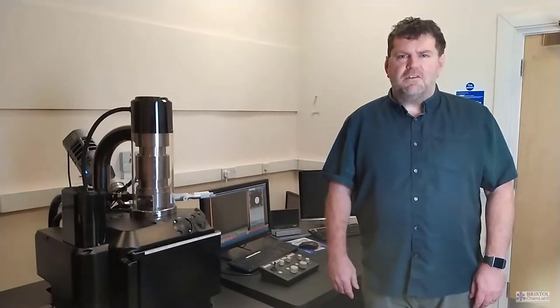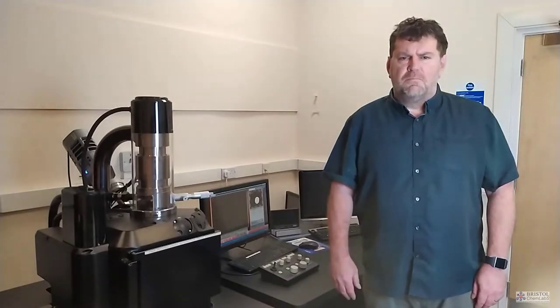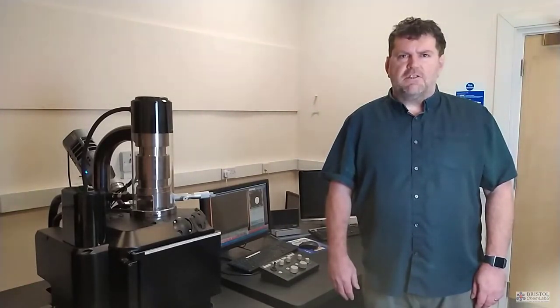Hello, my name is Sean Davis and I'm a Senior Lecturer in the Department of Chemistry at the University of Bristol. As well as teaching on the undergraduate courses, I'm also Director of the Chemistry Imaging Facility.